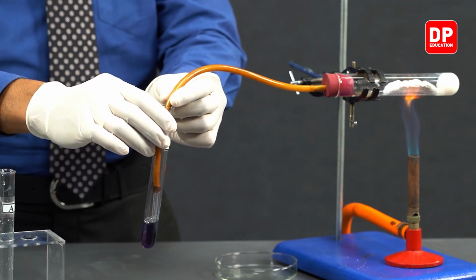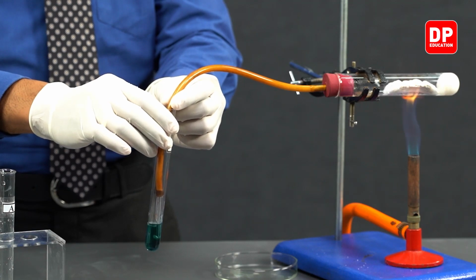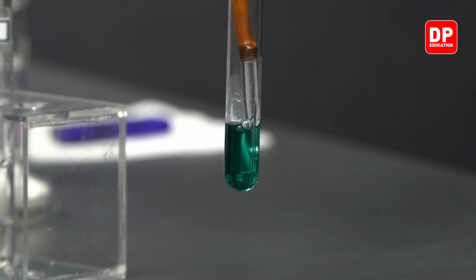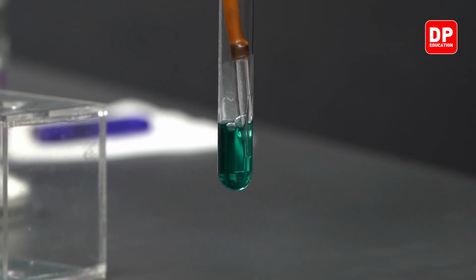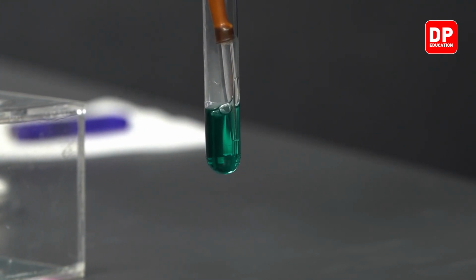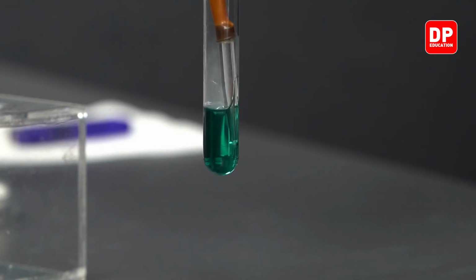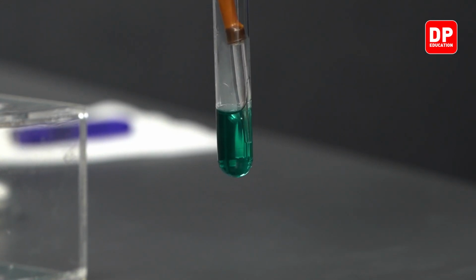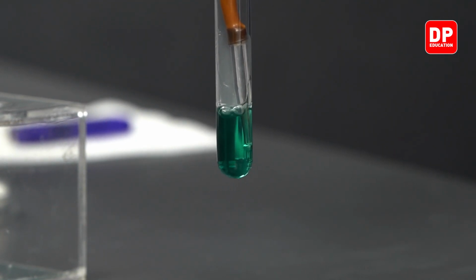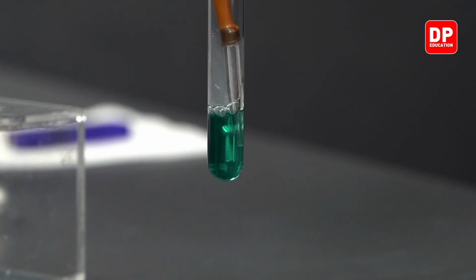You can see, as soon as we introduce this gas, first of all the purple color turned into a green color, and now if you continuously send this gas, you will observe that this green color turns into a brown precipitate. Since the precipitate is going to be suspended in the aqueous medium, it will appear like a brown solution, but you have to keep in mind it is not a solution, it is a suspension that is going to be formed.